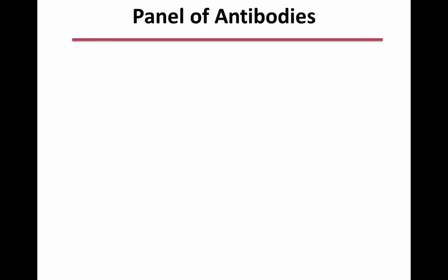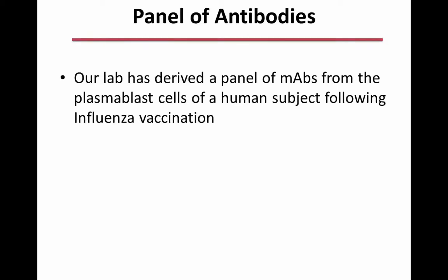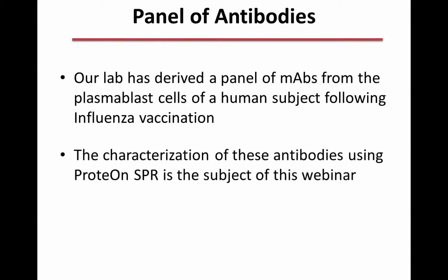A member of our lab, Yan-Chong Tan, has recently developed a panel of monoclonal antibodies that were derived from the plasmablast cells of a human subject 1 week following influenza virus vaccination. And the characterization of these antibodies that I've done using the ProteOn XPR system is the subject of this webinar.